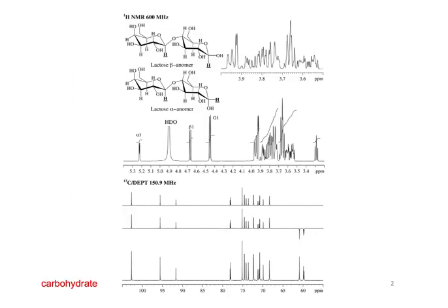All right, so this is from the text, but there's a series of spectra for this lactose, which is a disaccharide. I think the complexity of this, for one thing, we can look at just the normal proton NMR or even C13 for a sugar.